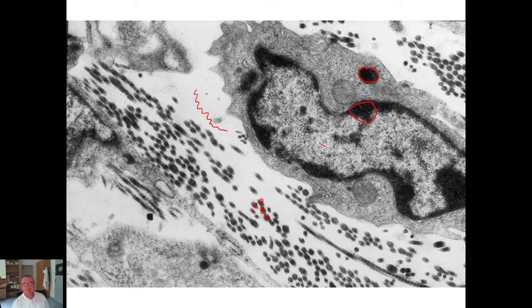And there are some gray materials like the cytosol of this cell, or these mitochondria, which can be declared as moderately or slightly electron dense only. Okay.